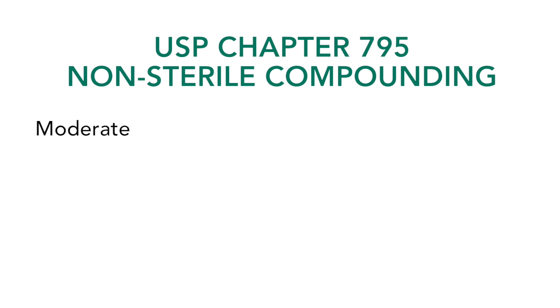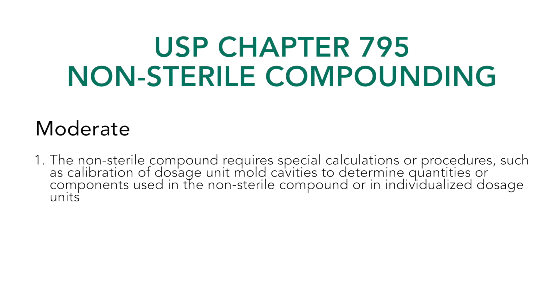There are two types of moderate non-sterile compounds. First, the non-sterile compound requires special calculations or procedures, such as calibration of dosage unit mold cavities to determine quantities or components used in the non-sterile compound, or individualized dosage units.